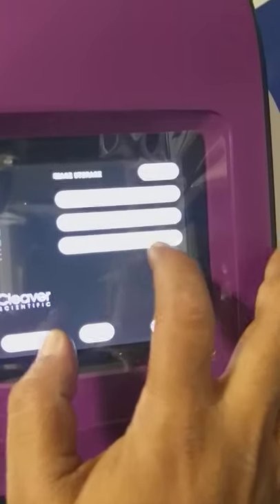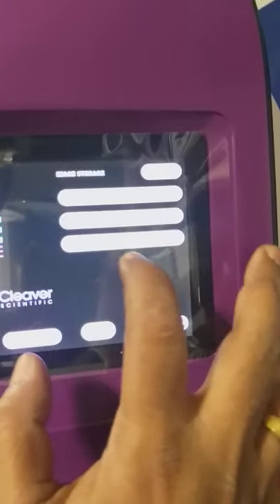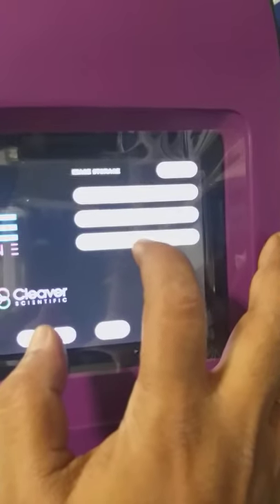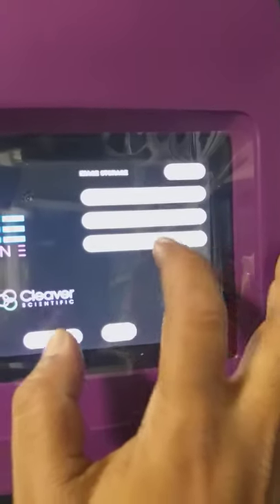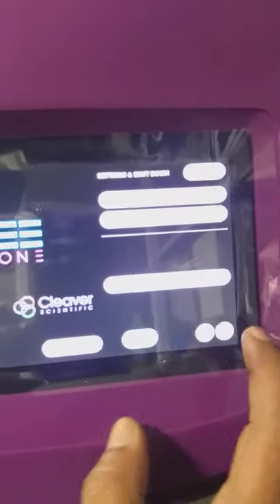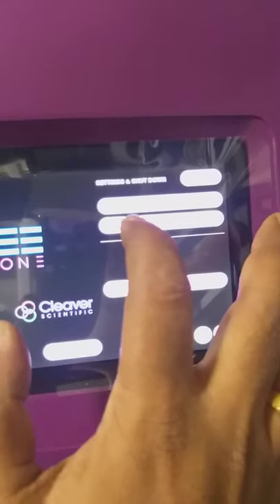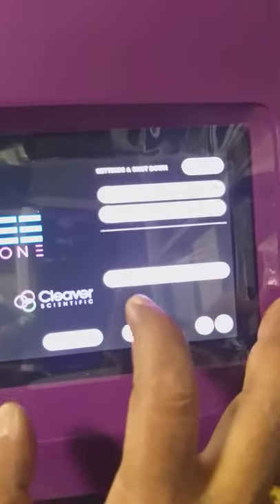Eject USB drive. Whenever you have to take out the USB, it is ejected from the system. You can press to eject the USB drive. After then it will come to settings — about the system information and shutdown.